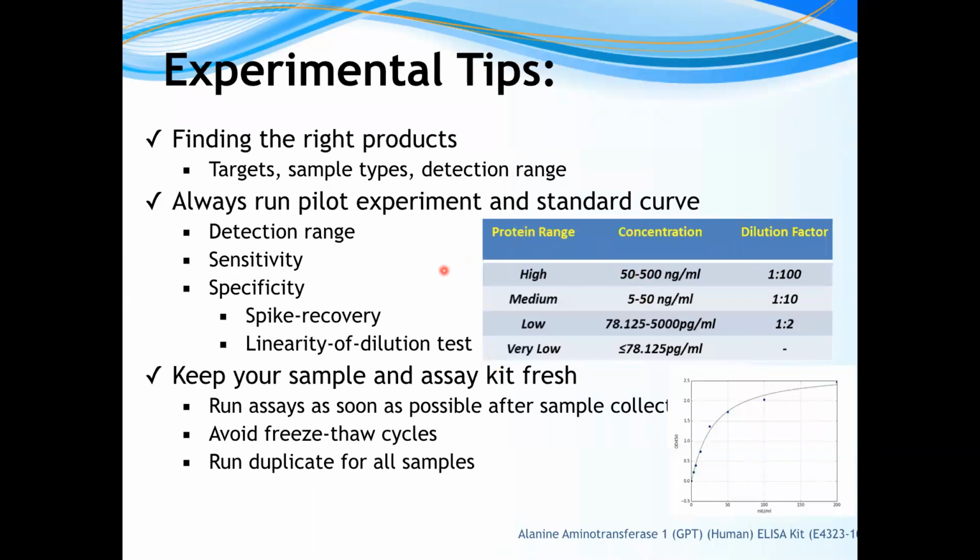If the samples are highly concentrated, then they need to be further diluted, just to make sure that the concentration of the sample is in the range of the standard curve. And it is also very important to include the dilution factor in the calculation.